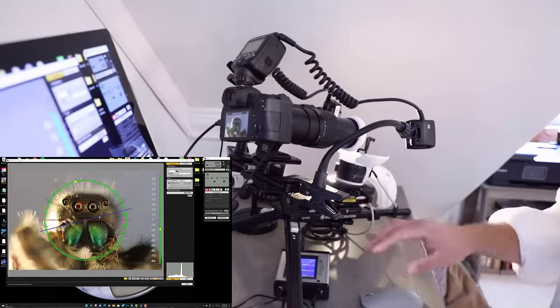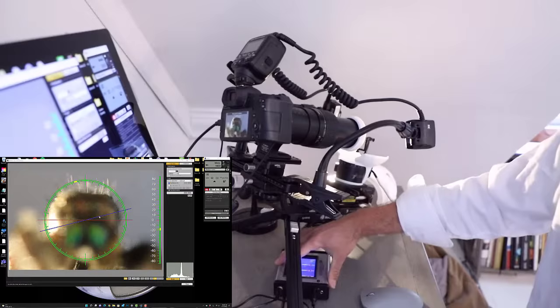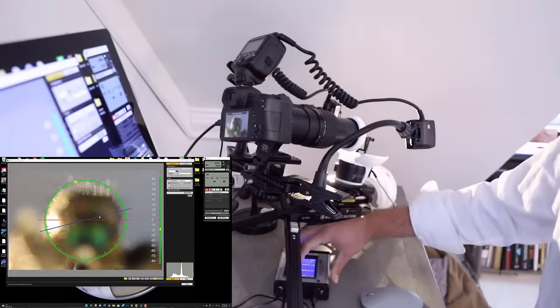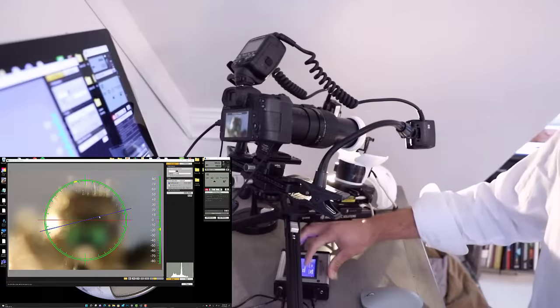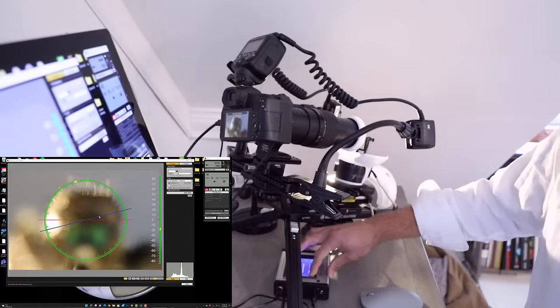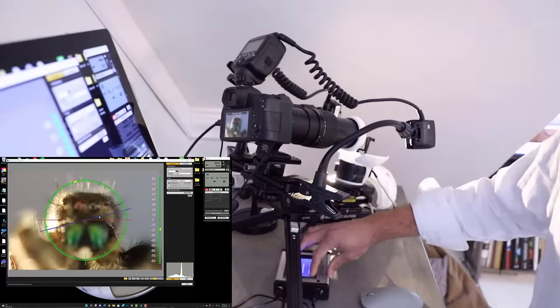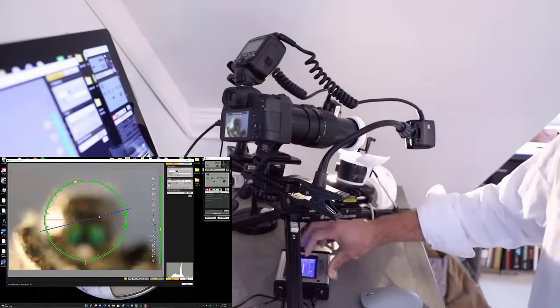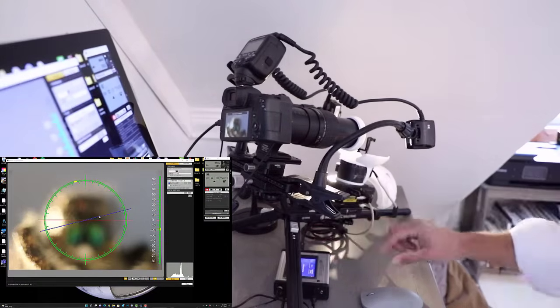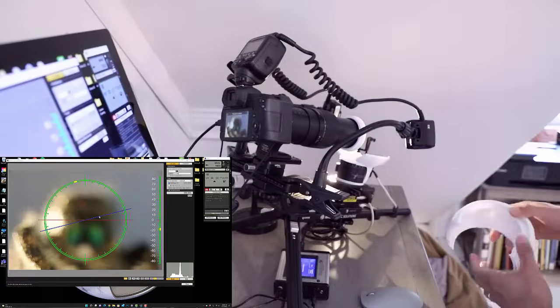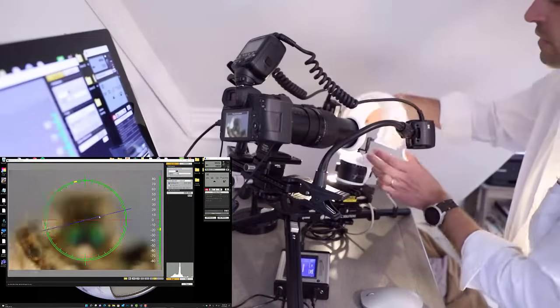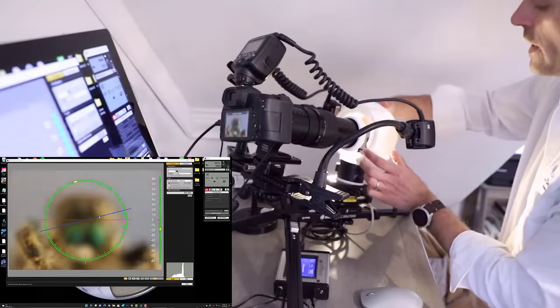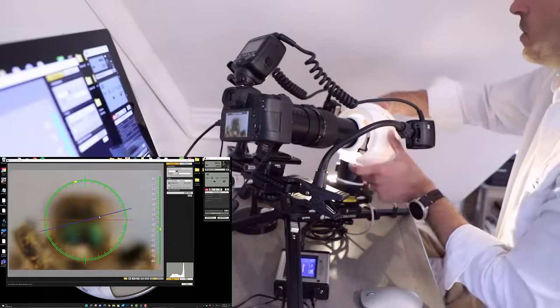The next step after we have this, we could just go right ahead and move all the way to the rear. Set our focus stacking parameters up so that this will be the starting position, moving all the way through until everything just starts to go out of focus. That's going to be our end position. The depth of field is going to be 40 microns at 5x magnification. This is the full magnifying capabilities of the MPE 65 millimeter.